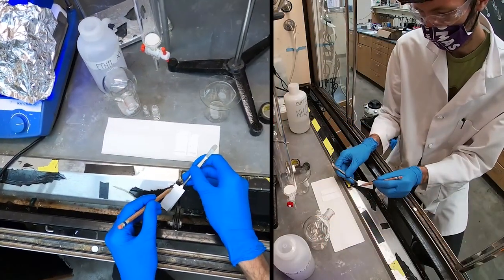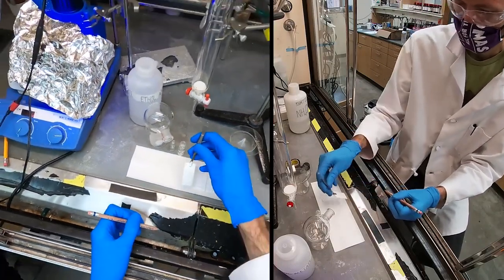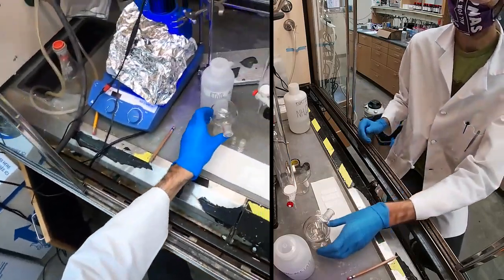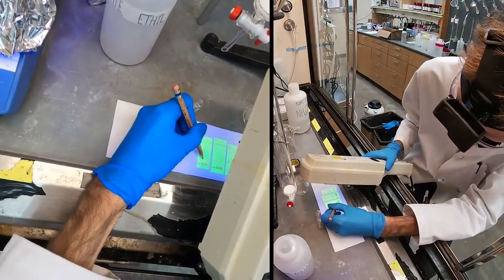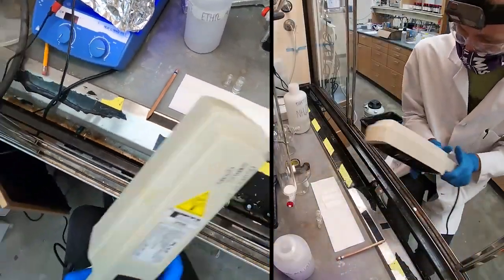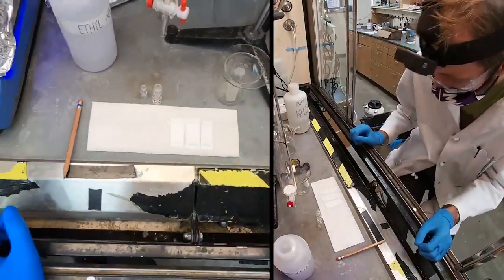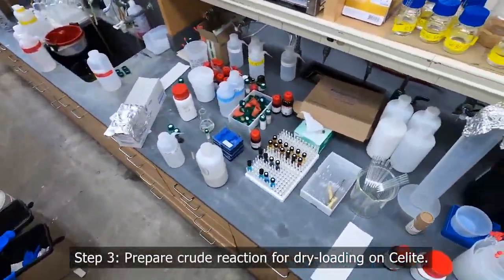So that 20%. And now we'll see if this one exaggerates that delta RF. Oh wow, really not. In fact, they're really close together on this plate. So this is kind of what we've got going here. 30% honestly looks to be the best. And we're ready for our dry load.